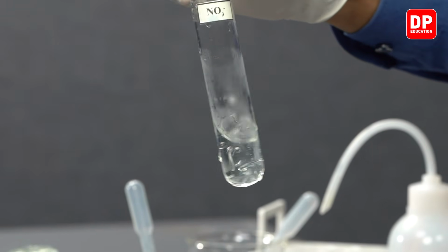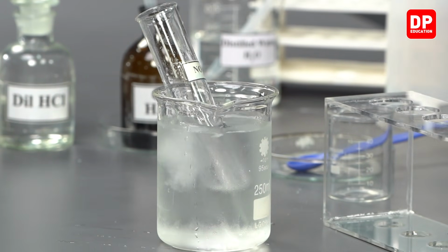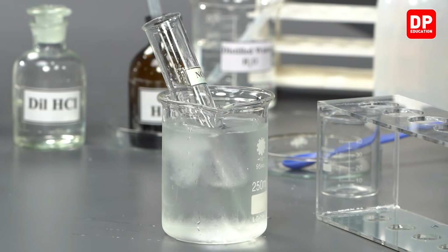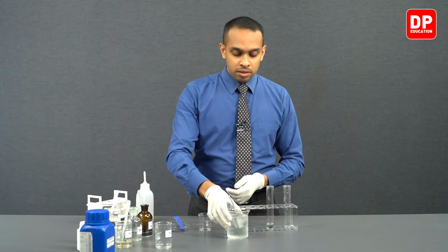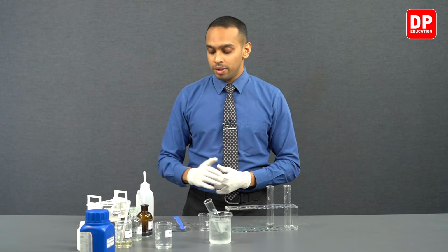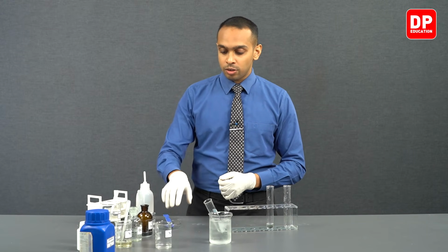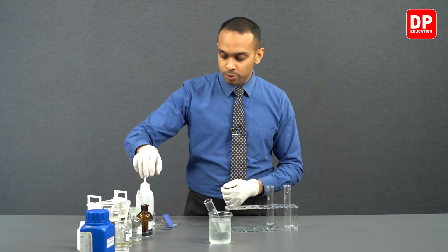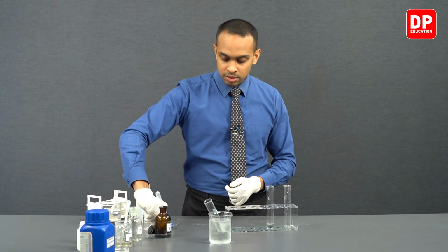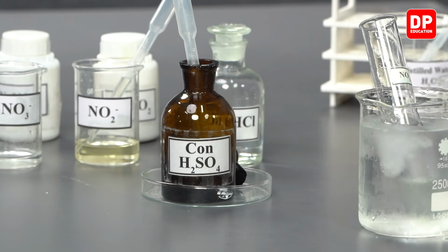After mixing the two, we can keep it placed inside the ice water bath for a while, and until it gets ready, we can prepare to add concentrated sulfuric acid to this reaction mixture that we have here.